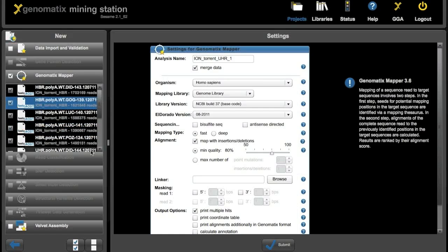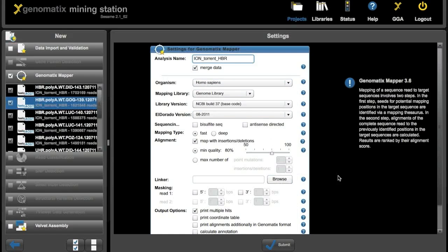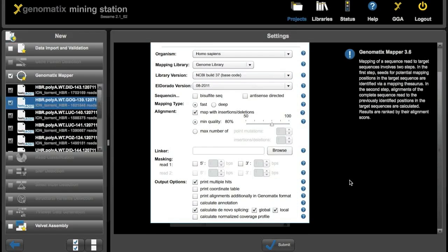And as you can see the parameters have been left the same. So again just a small correction here to the name. Everything else has stayed the same. And clicking on the submit button will start the second analysis.